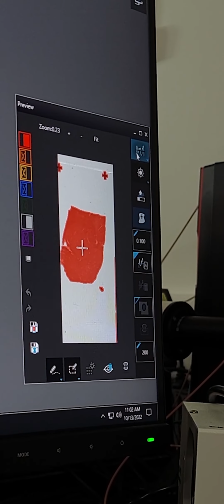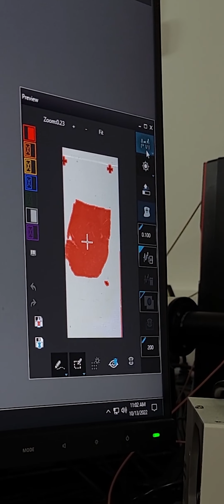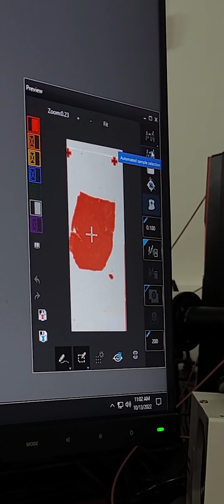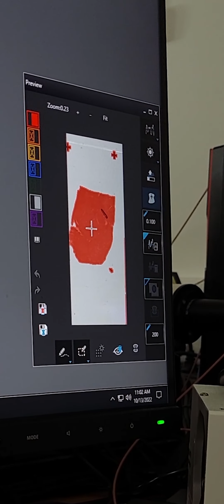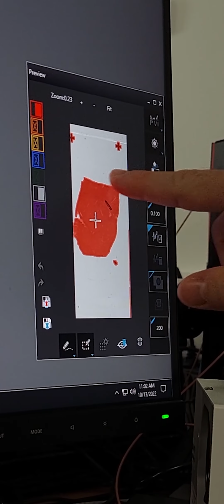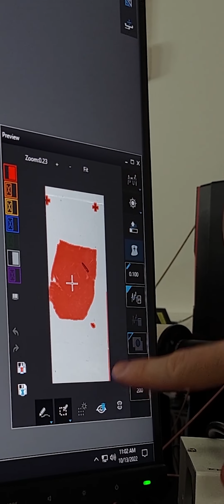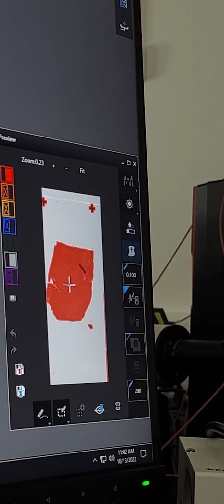You can use the preview image for this. You can have an automated sample selection. Okay, so the software is using the preview and the threshold to find the sample. I think it did a really good work here. Because this is the sample, but of course it has included many other things, so we will see how to make those disappear.